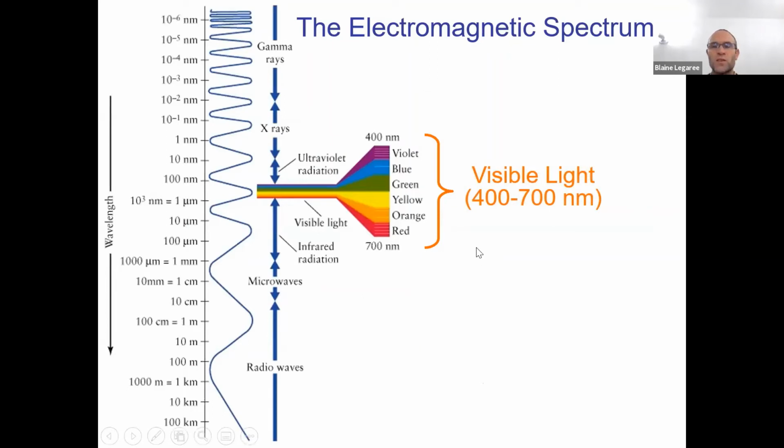So this was conceived of in the 1930s, and actually I believe there were people at University of Toronto that were involved in developing the electron microscope. And the whole concept is that you take a look at a light microscope. Here is the visible light, and the wavelengths are in the 400 to 700 nanometer range. So that means we can see something kind of one-to-one, so in the 400 to 700 nanometer size, right? So I had given you a number which was 0.2 micrometers, which is 200 nanometers. So it's kind of in that range, right?